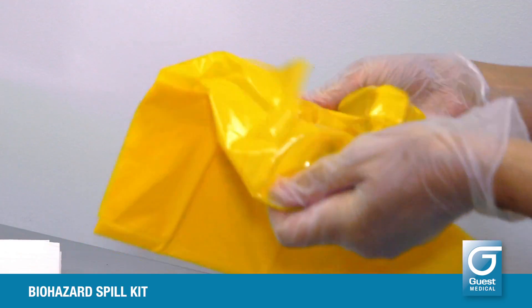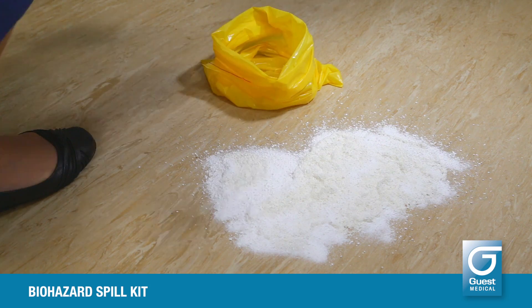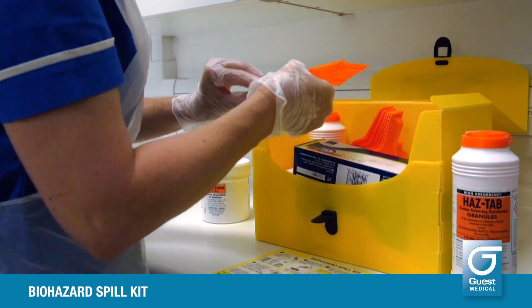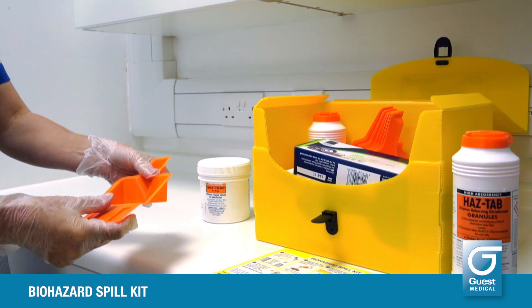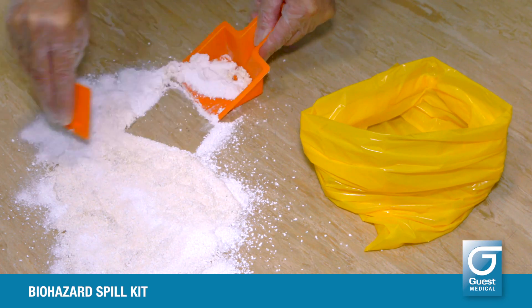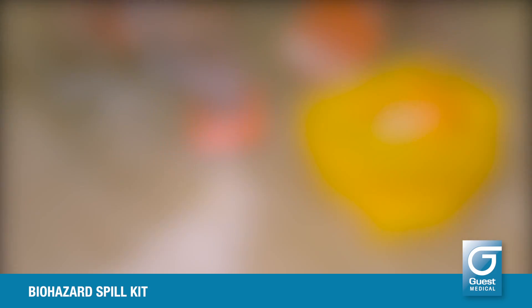Take a waste bag from the kit and set it up as near to the spill as may be conveniently possible. Take a disposable scoop and scraper from the kit box and tear off the scraper.